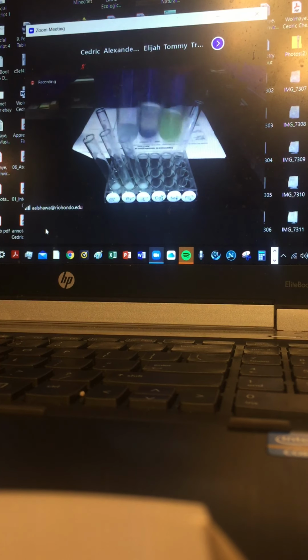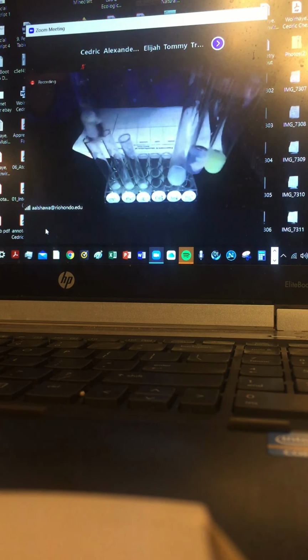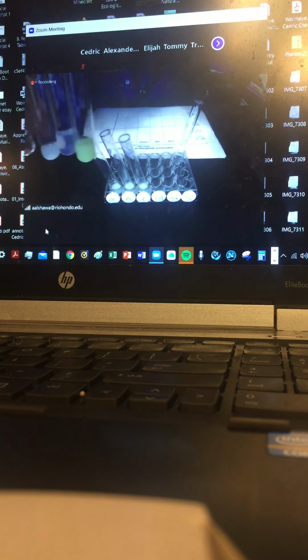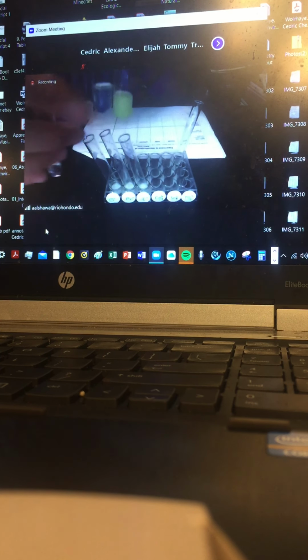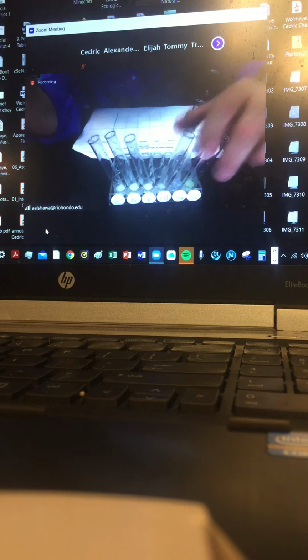So you can tell them apart. Compare all these, I want to hold them correctly. Compare these to this original color. Just make sure you note exactly what we have. The first one is the carbonate, the middle one is the sulfate, and the last one is the phosphate. That's the outcome upon addition of the silver nitrate.